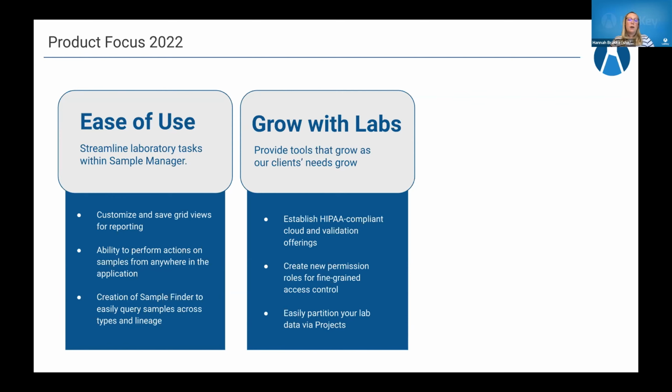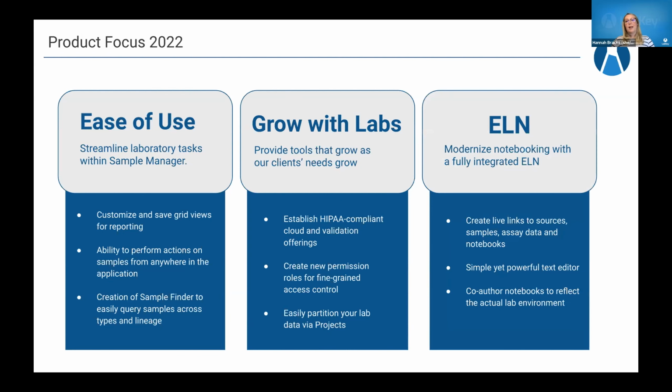We've also launched our projects notion, which allows labs to really easily partition their data into projects and have that data be more secure. And of course, we also launched our electronic laboratory notebook this year that is this fully integrated ELN that's truly data connected with the data that's in the system. And I'm actually going to be talking about this a little bit more in my next slide. So we'll go to that.